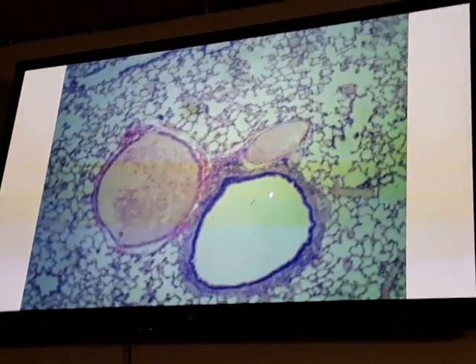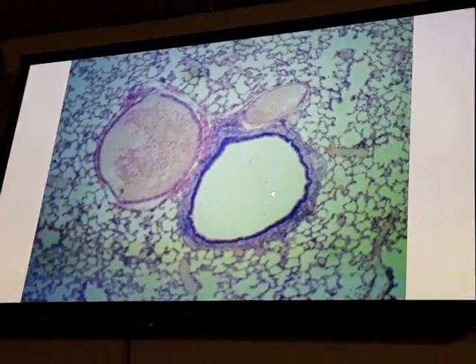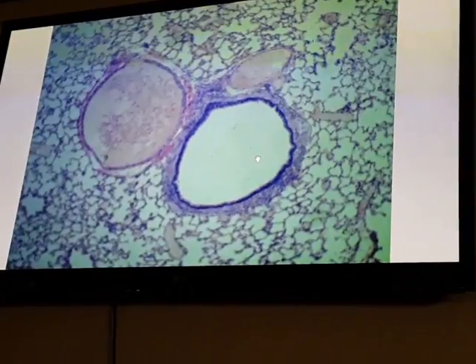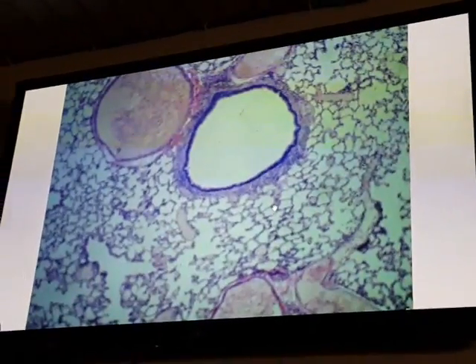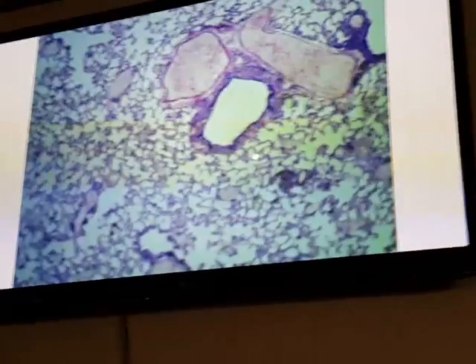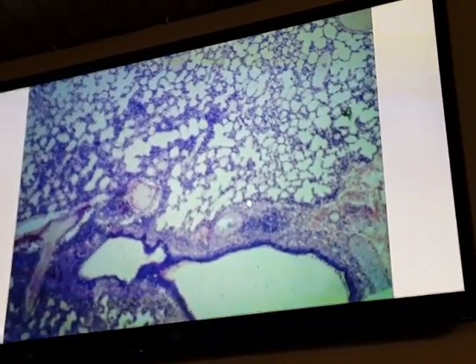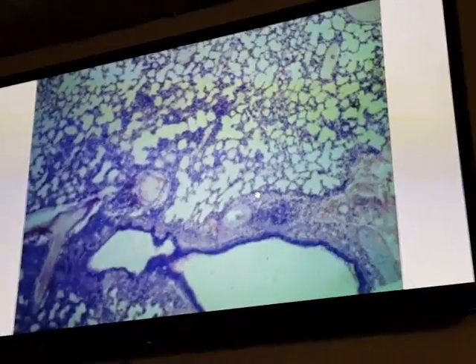Each primary bronchus subdivides into 3 bronchi in the right lung and 2 in the left lung. Each is also divided into bronchioles, and then the bronchioles divide into terminal and then respiratory bronchioles.